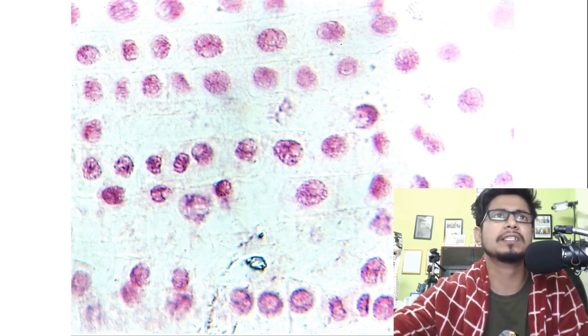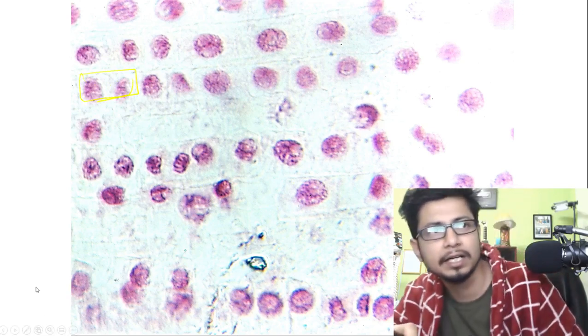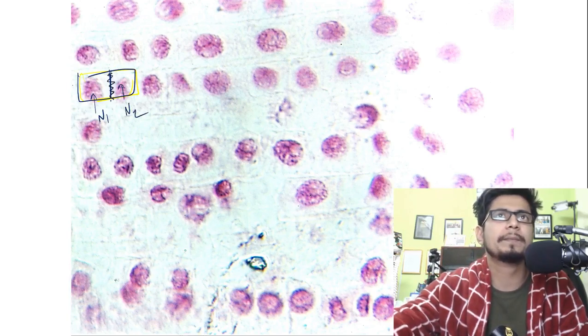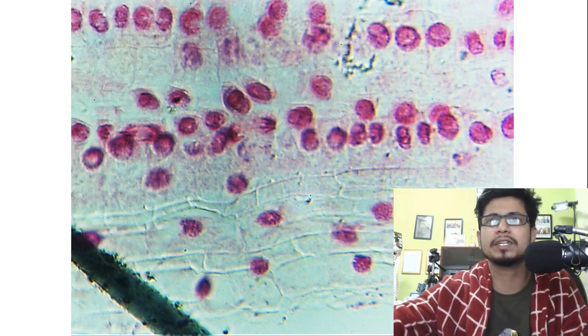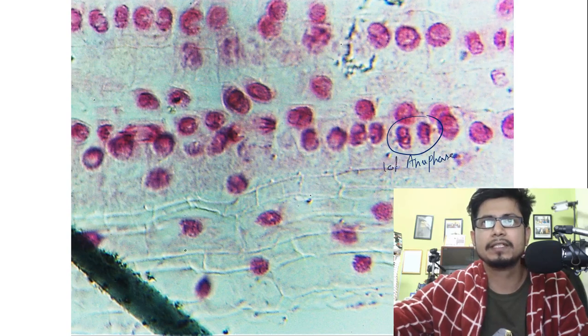And the cytokinesis is visualized in this picture. Here you can see the two cells — nucleus number one, nucleus number two, and the septum in between. You can clearly see all these beautiful pictures. This at the end is late anaphase.